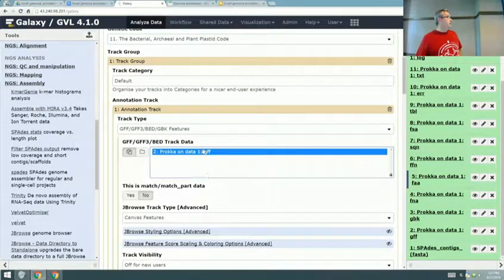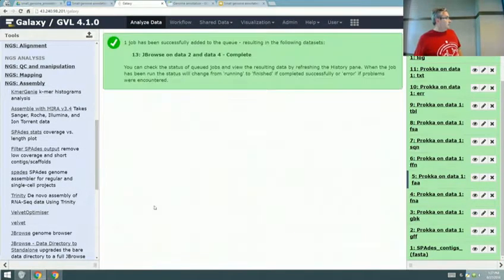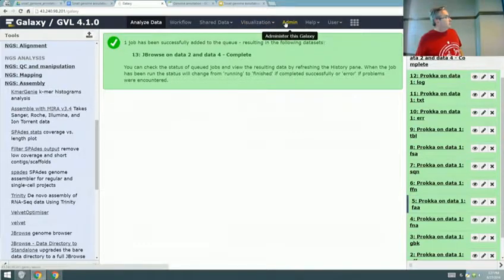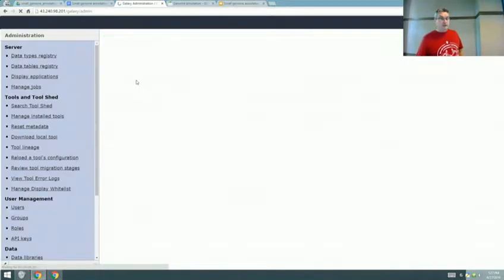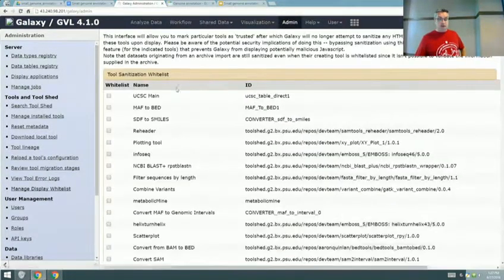Yeah, but that's okay because you're not meant to use the wild type. It didn't match exactly. Okay, fair enough. Well, I made it simpler on this one. I didn't put the wild type in there to confuse it. Yeah, and then when I hit execute and got it up on the side, it was, oh, it hasn't been taken off the whitelist yet. Okay. Yeah, that was the thing. That's my fault. Should I go to the other? No, it's okay. I'll just get it off the whitelist.